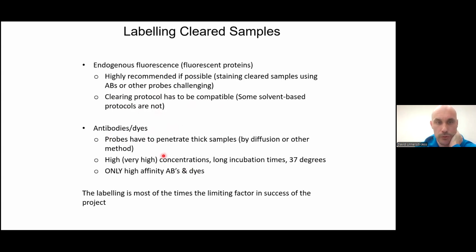Now, of course, these probes have to penetrate your thick sample, most often by just diffusion. And antibodies are large molecules, so they will diffuse pretty slowly into your sample. So this is something to consider.